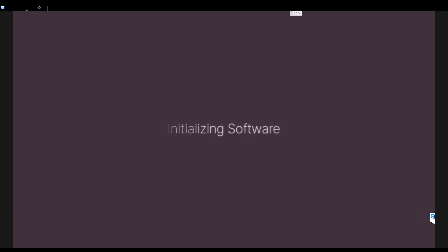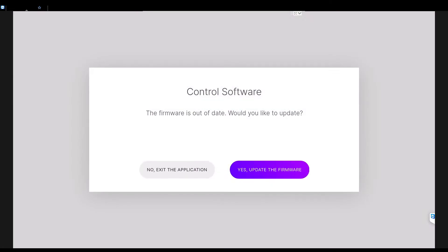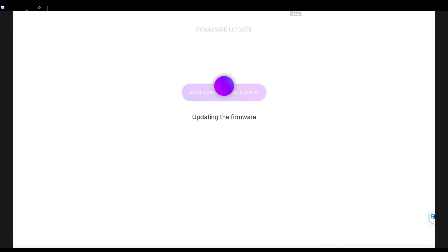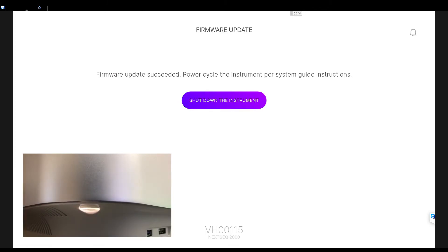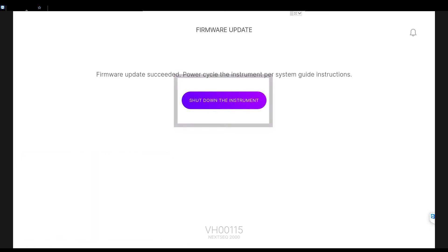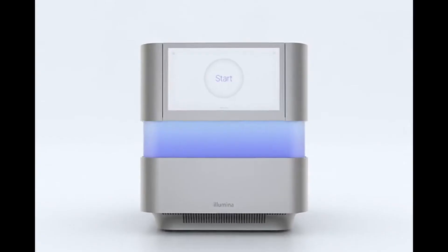The new control software automatically launches. After initialization is complete, a notice appears that the firmware is out of date. Select Yes, update the firmware. During this process, the screen will go blank. Wait for the image to return and the process to complete. If the image does not return after 5 minutes, proceed to the next step and manually toggle the power switch. After the update is complete, follow the prompt to power cycle the instrument.